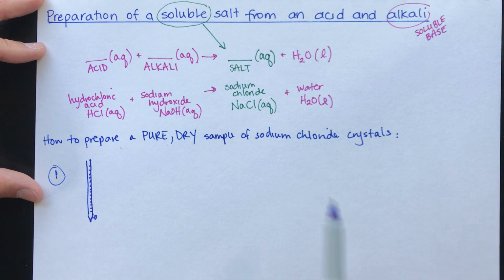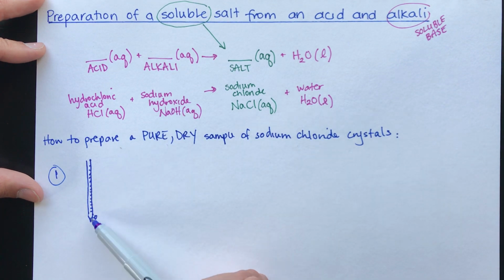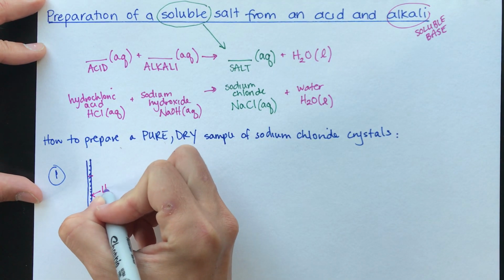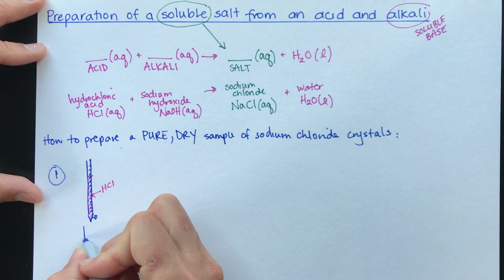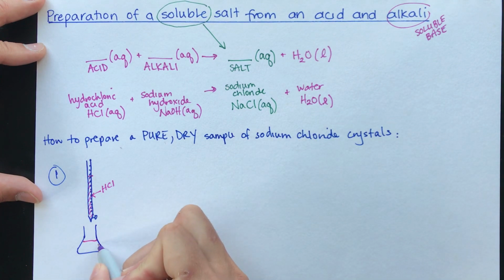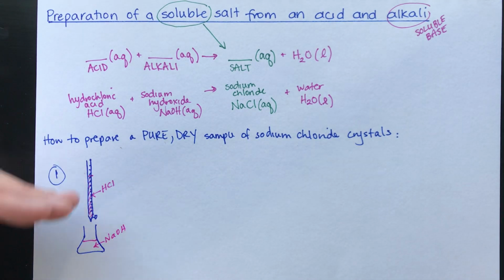Now in your booklet, I've done the experiment so that we add acid to alkali, because I don't like when you have NaOH in the burette and students don't clean it properly, the burette can get clogged. So I'm going to do it that way on here. It actually doesn't matter which you put in. So we're going to start with HCl in our burette and NaOH down here in the reaction vessel, which is just going to be a conical flask. Okay, so here's my goal. I have NaOH, I'm going to add HCl.